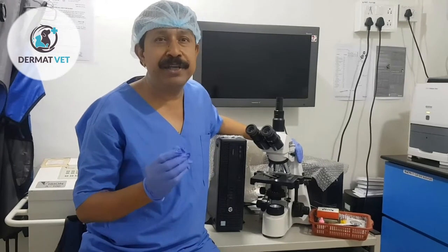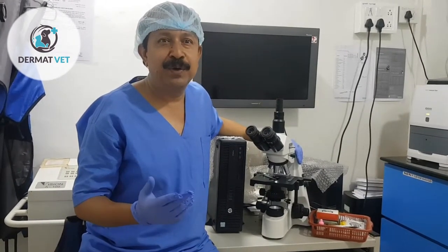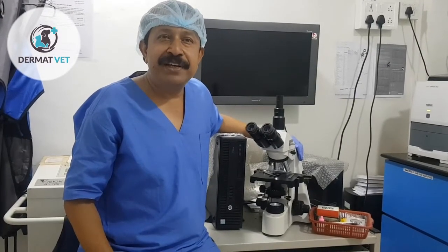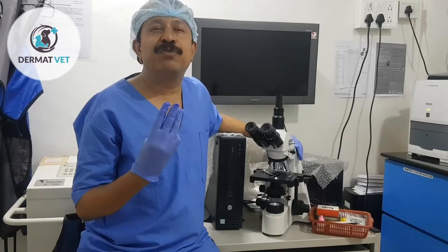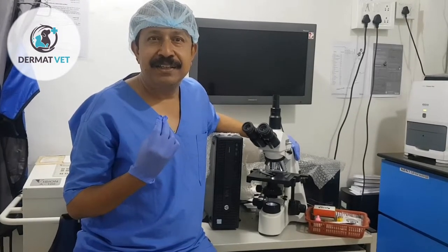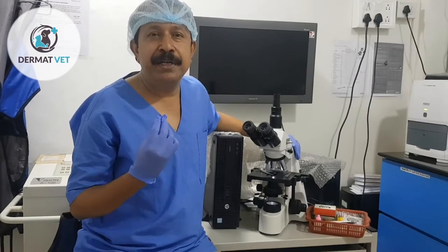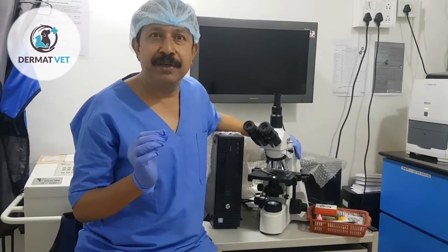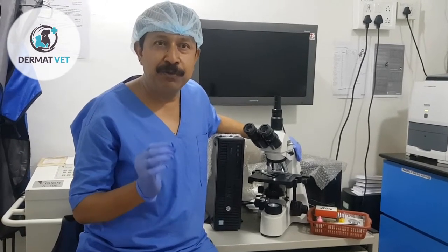It is very simple, and I am going to share with you how simple it is today. In veterinary dermatology, there are three techniques for how to collect a sample in skin cytology.